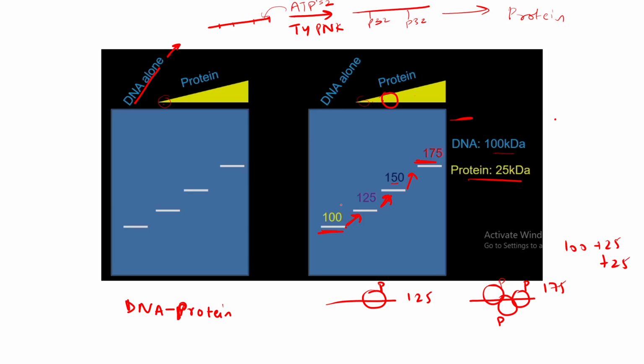So that is why this is now also seen as harmful. Yes. So that is why people nowadays actually use antibodies to visualize. The antibody will bind to that particular position. It's like how you do Western blotting for proteins. For DNA and RNA also, we have Southern blotting and Northern blotting. So I think we'll study these different kinds of blotting techniques in the next series.